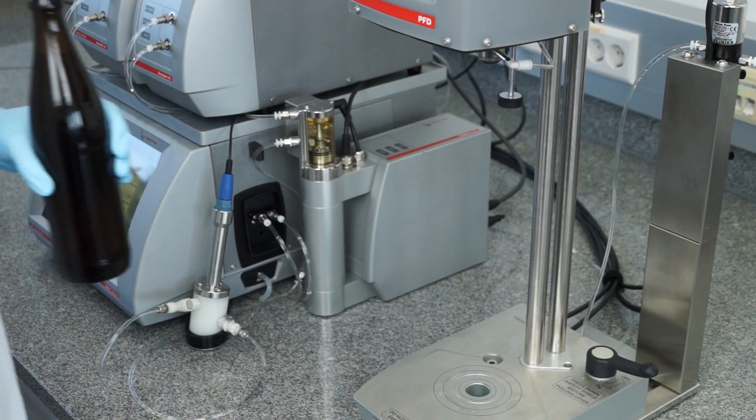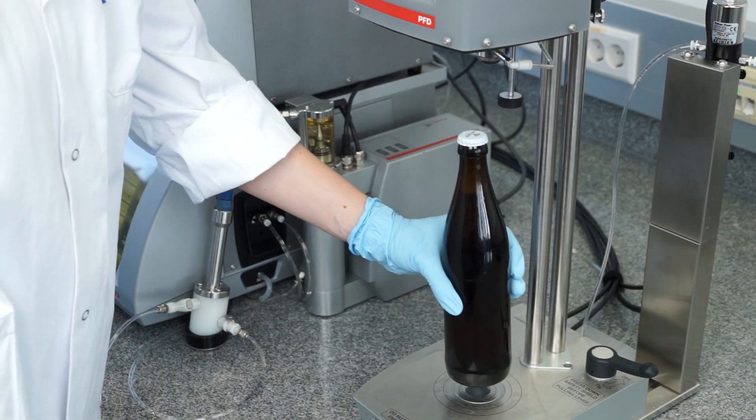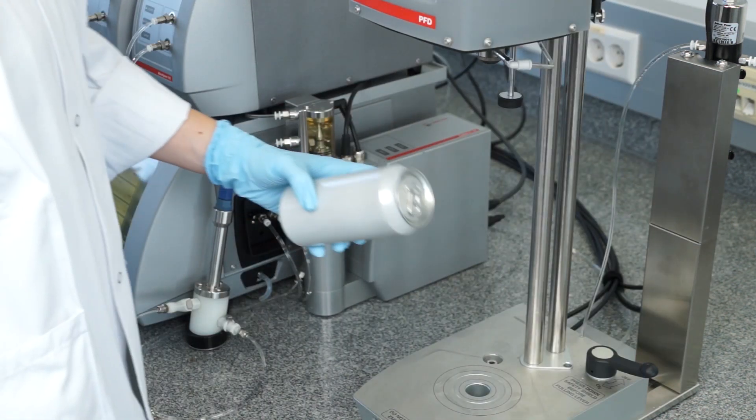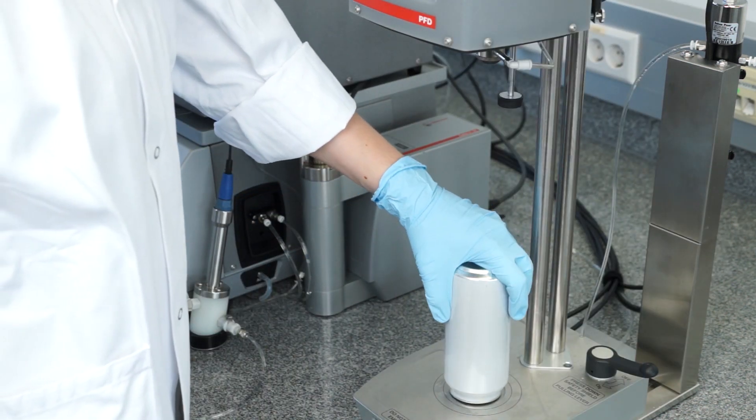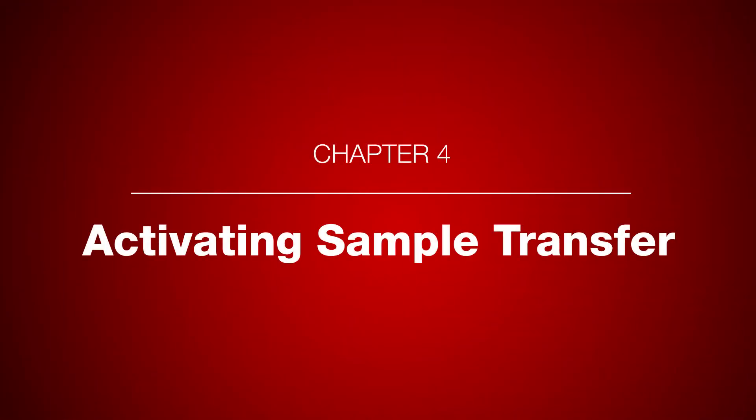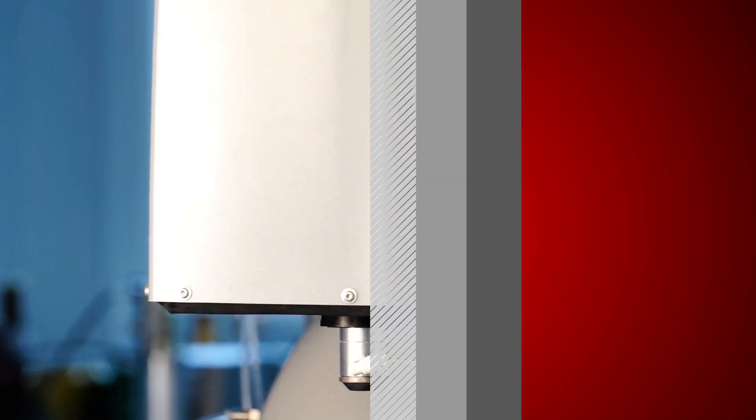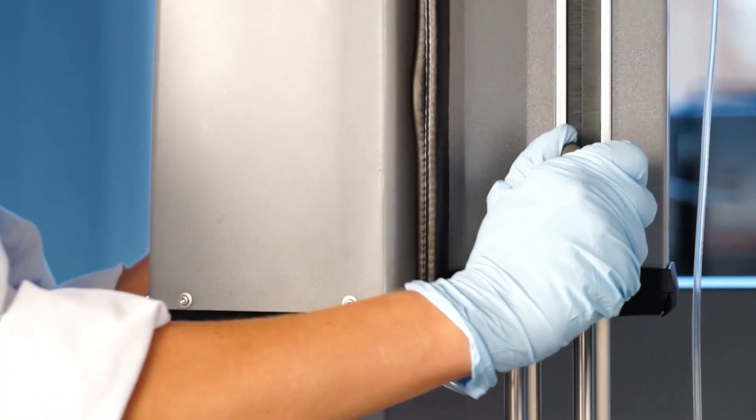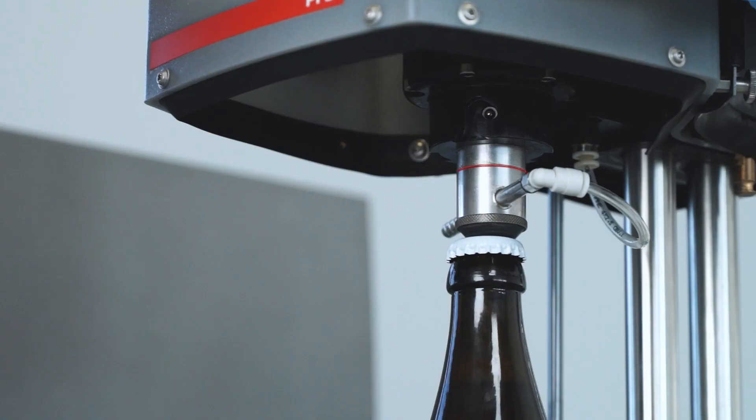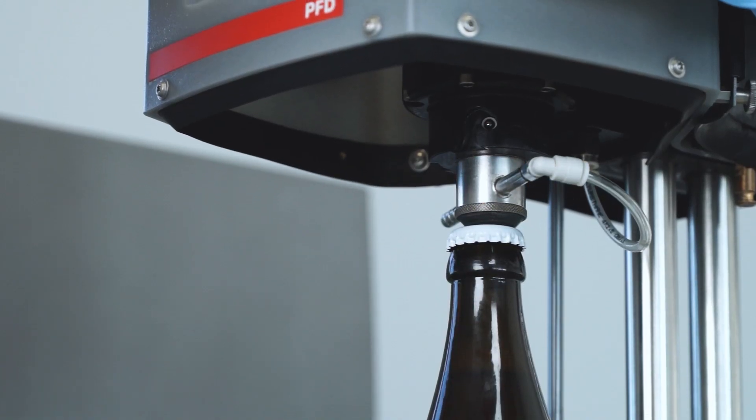Glass bottles can be inserted as they are. For proper sample transfer, the filling device needs to be adapted according to the sample container. For cans and glass bottles, adjust the height so that the ring disappears under the piercing head.